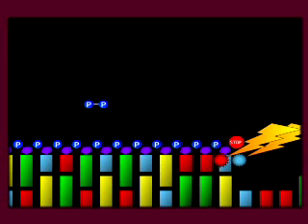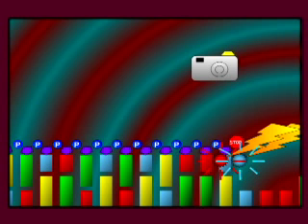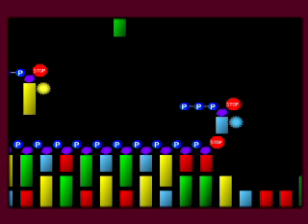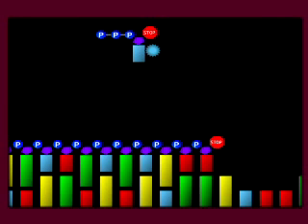The removal of the dye and the terminator is difficult and not foolproof. If the dyes are not completely removed, then 2 colors will be read by the camera in the next cycle. If we fail to remove all of the terminators, then the signal strength will be decreased because fewer dye-labeled nucleotides will be incorporated in the next cycle. Because of these difficulties, the maximum read length of Illumina is about 100 bases, and there can be a small error rate of incorrect bases in the sequencing reads. Both the Genome Center and Illumina are working to increase the read length, but for many sequencing projects, this read length is sufficient. What about paired-end reads?